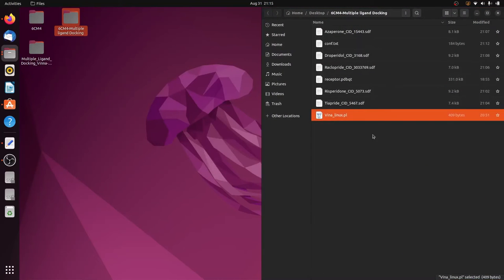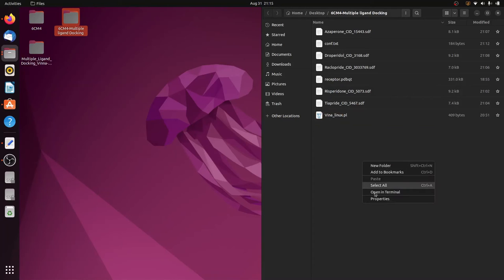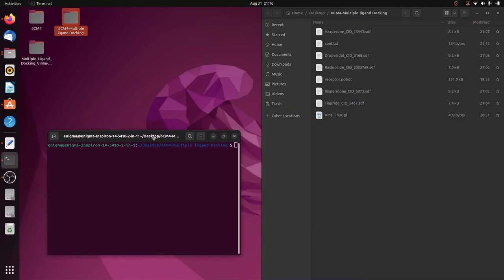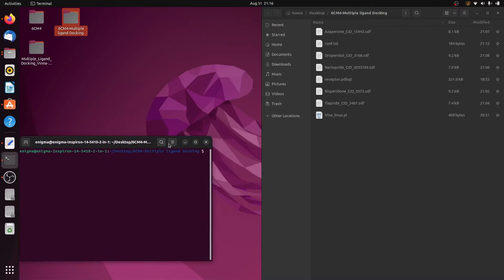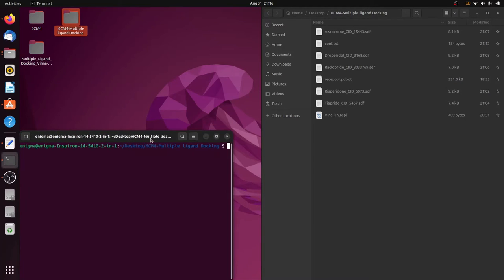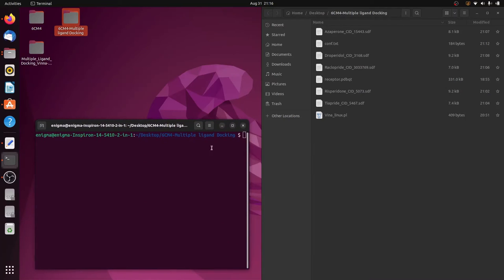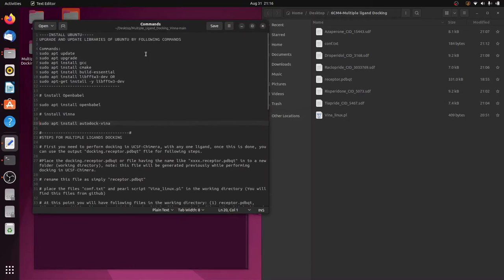Now open the working folder containing all the ligand SDF files, receptor.pdbqt, the configuration file, and the Perl script. Right-click in the empty space of this folder and choose 'Open in Terminal'. This opens a terminal specifically in that working directory — the path should show 6cm4 multiple ligand docking.